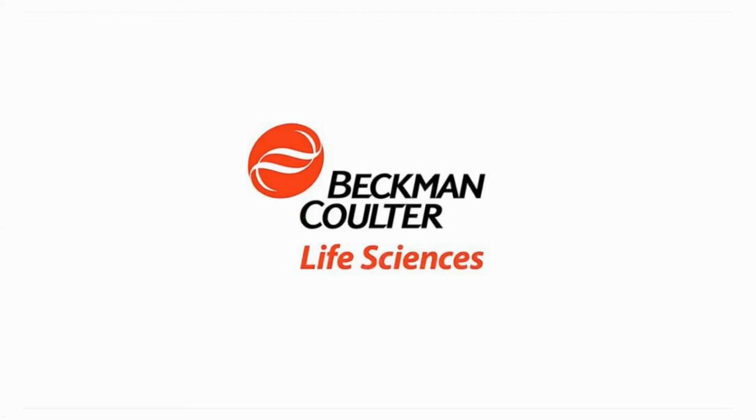We are looking at other things too, future technologies. One of the things we're thinking about in the mobile robot space is using those to preload these systems in the middle of the night. You could think of this fleet of islands of automation that we have.